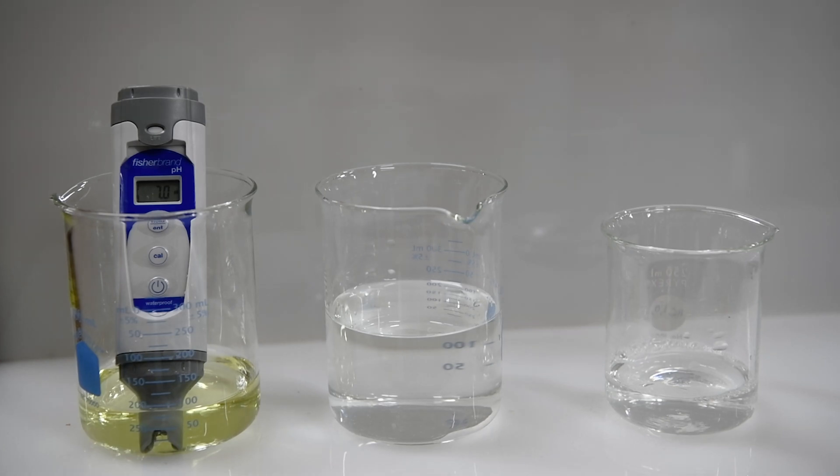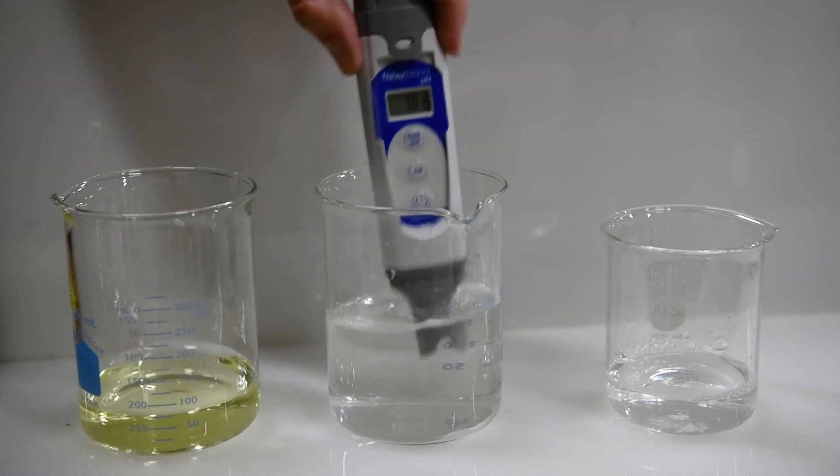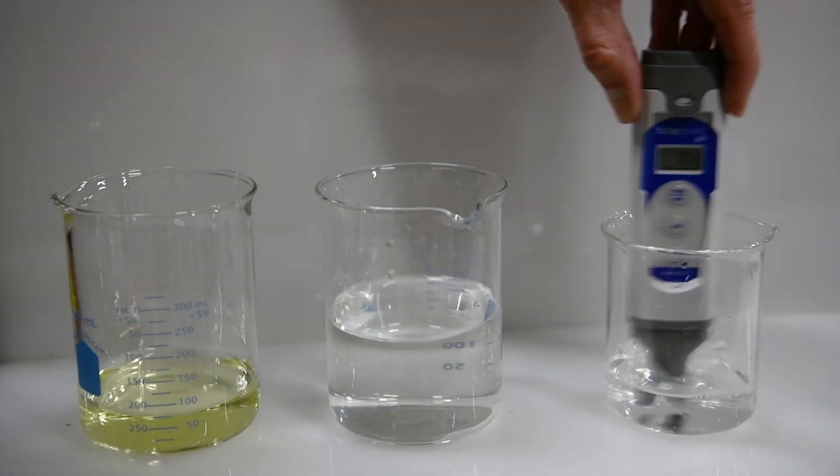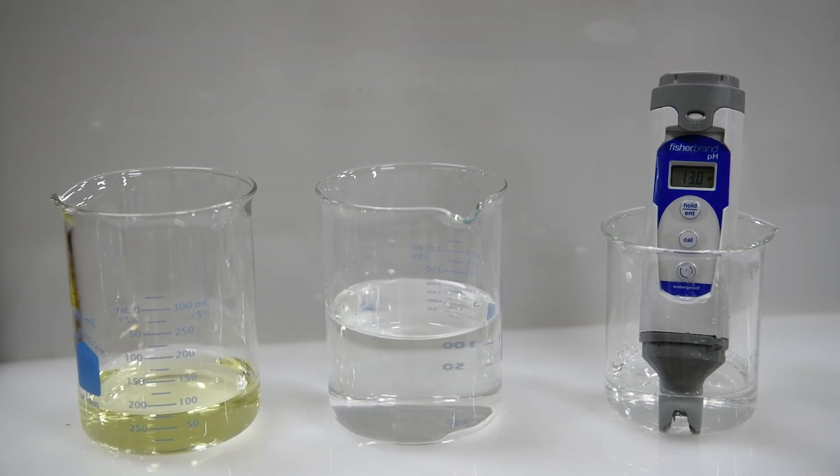Our last sample will be ammonia. So we'll rinse off the probe, place it in our ammonia. Wow, looks like our pH is at about 13, so ammonia is apparently very basic.